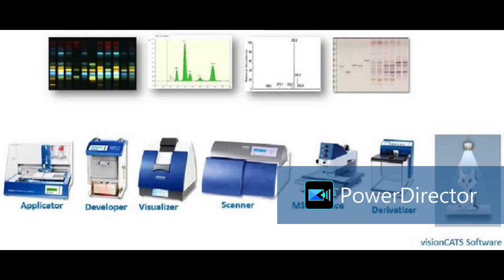In sample application, what the concentration and volume should be, we need to decide based on our expertise and based on the protocol. If a method already exists, you can follow that. After sample application, chromatographic development in a suitable developing chamber like a manual twin trough chamber or humidity control chamber, or gradient type of HPTLC you can do. Then image documentation. We can capture the plate images under different illumination, UV light, fluorescent light or white light, before derivatization, after derivatization, any time in between the analysis we can capture the plate image.